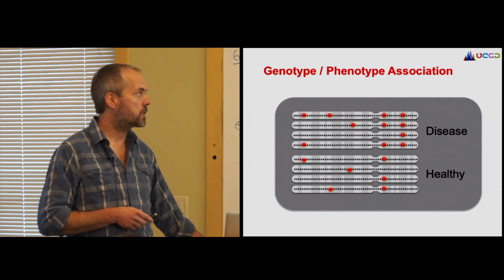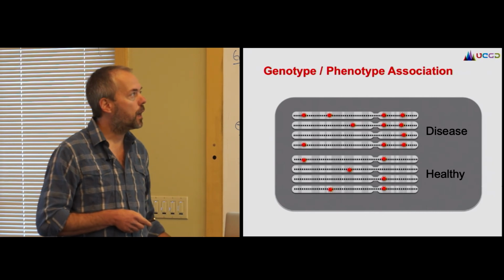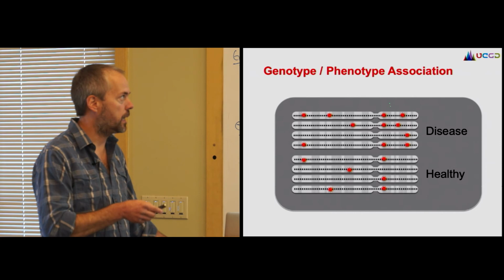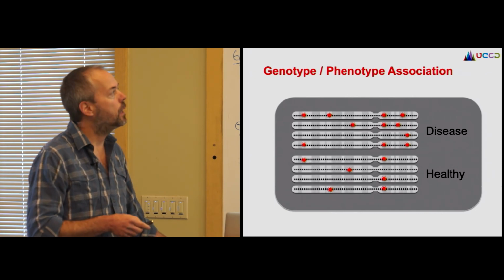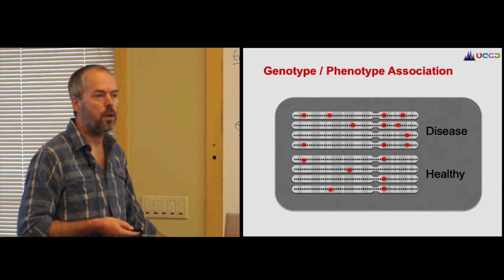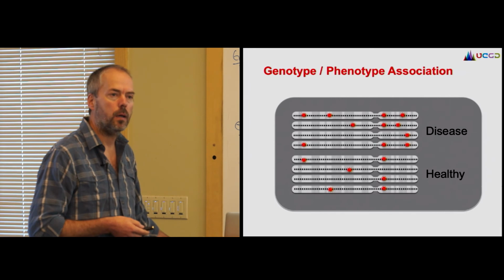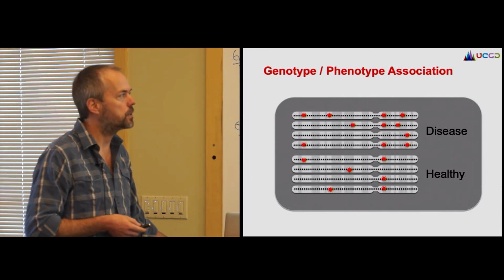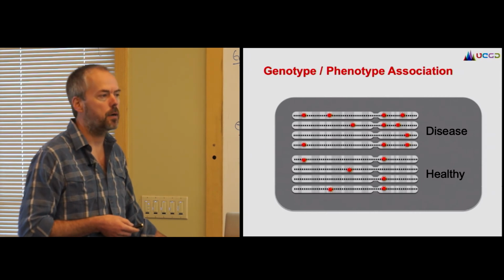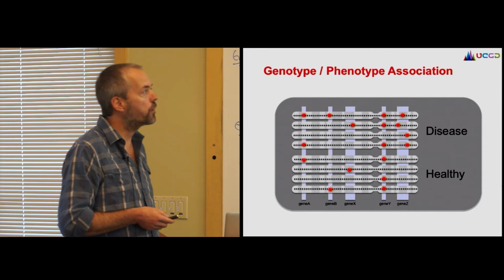Of course, if these are unrelated individuals in particular, we don't expect to have the kind of allelic homogeneity that would be the case if everything just lined up. And so we can have rare alleles in different individuals contributing to the same phenotype. That is more difficult to assay or to test for, but with presumably the entire genome or the entire exome sequence, we have all those rare variants, and so we can come up with strategies to do that.